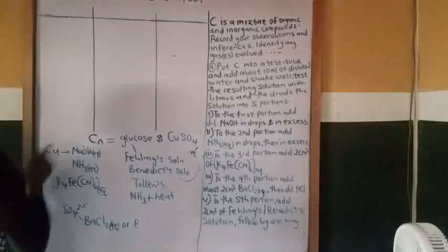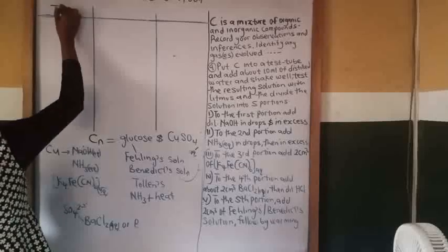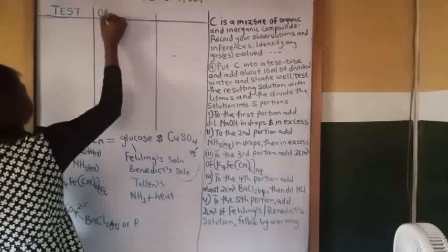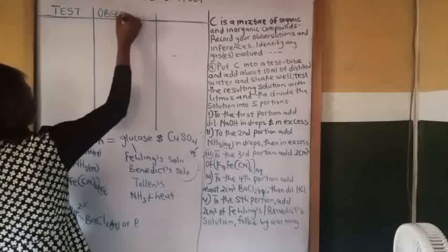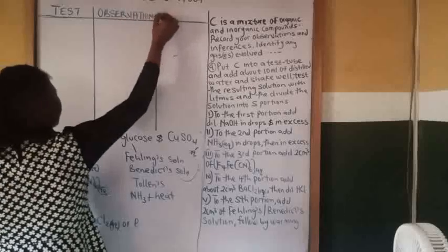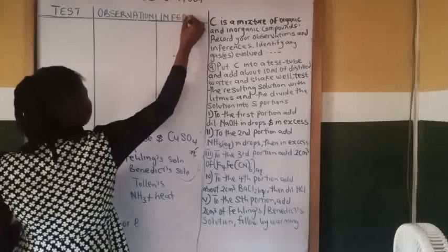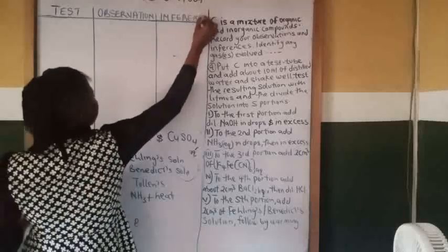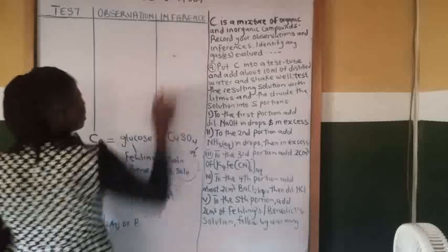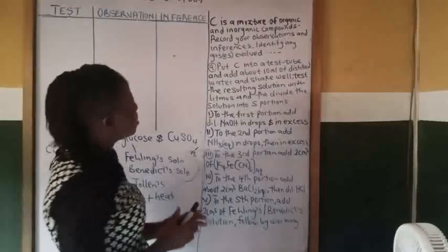So let's do that. Test, observation, and inference.